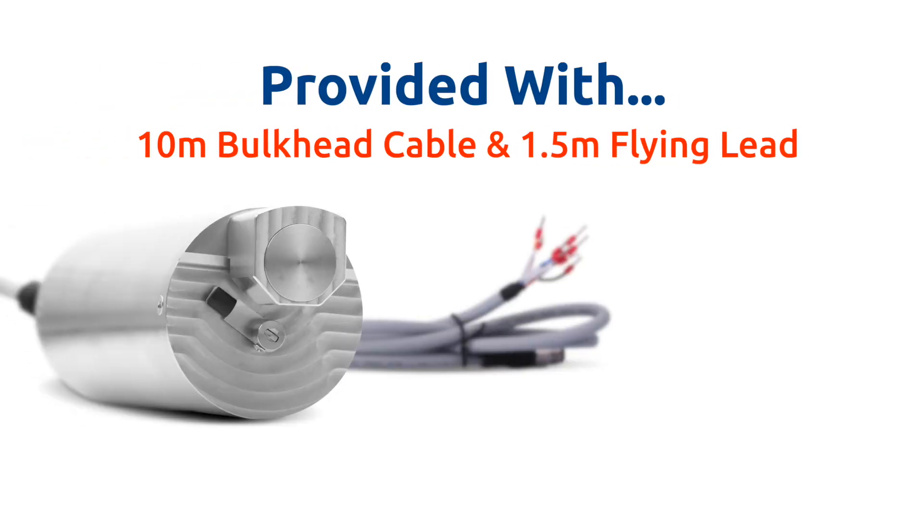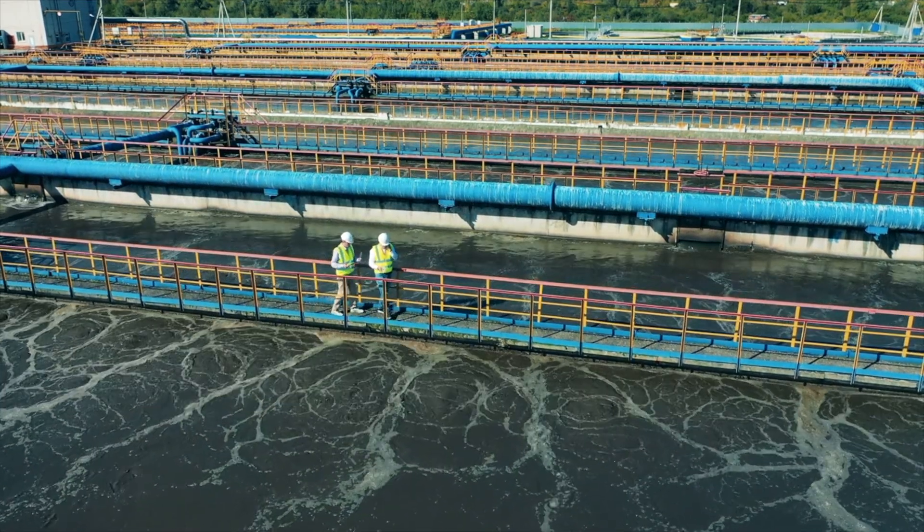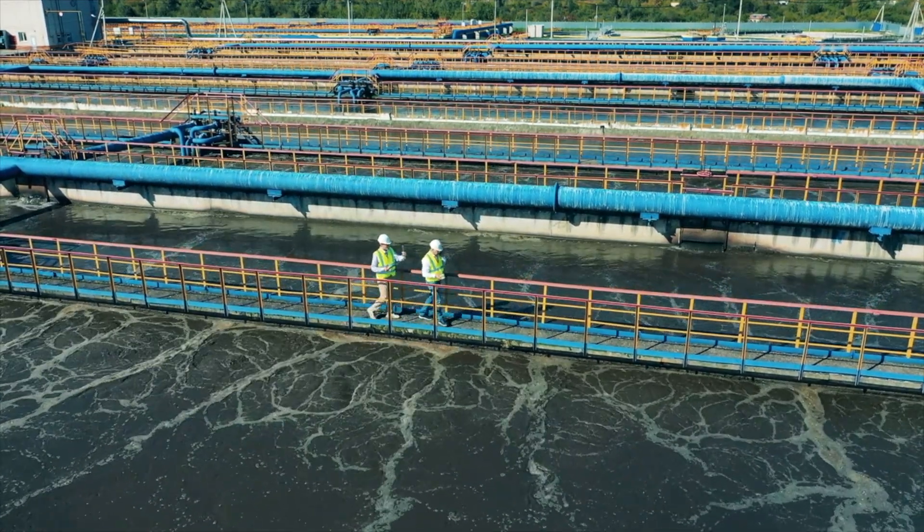The LT635 is provided with a 10 meter terminated bulkhead cable and a 1.5 meter flying lead cable for rapid connection and startup. The sensor may be field calibrated using gravimetric suspended solids test results of the sample at the point of application.